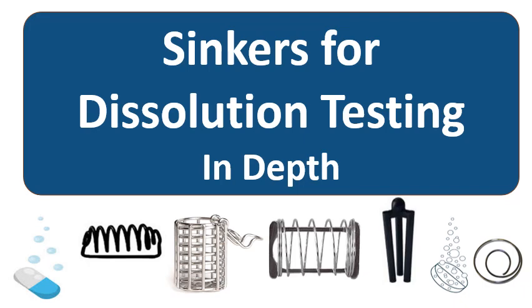on dissolution testing. In this topic, mainly the sinkers will be discussed in detail. When sinkers are required to be used, what are the different types of sinkers, why sinkers are required, what is the requirement, how these sinkers are selected, and what are the pharmaceutical requirements for sinkers or related to sinkers, and the other requirements for the formulation based on each specific formulation that will be discussed.